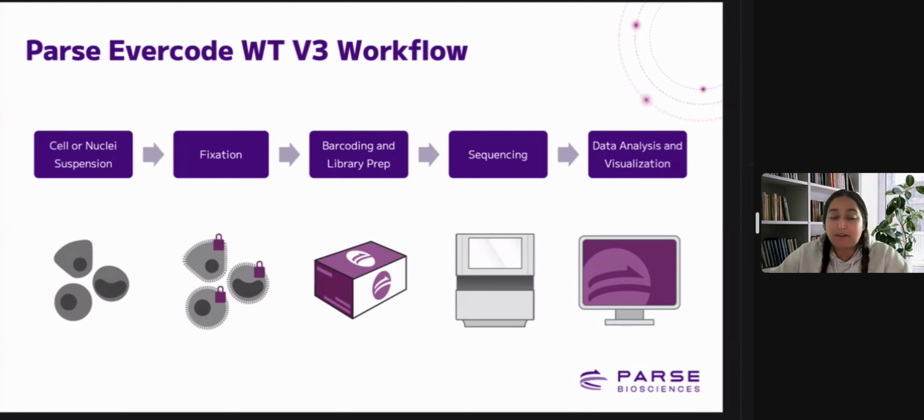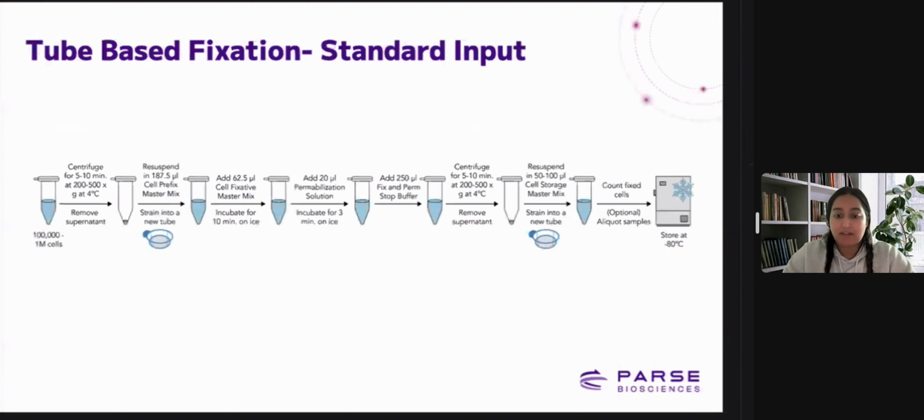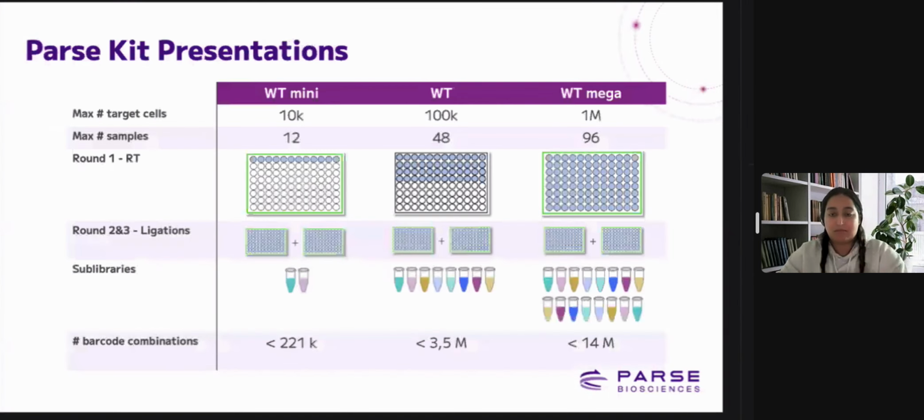After we're done with our libraries, we'll send them for sequencing. When you guys get your FASTQ back, we'll meet again virtually, and I'll show you our different platforms available. I'll actually show you a little bit today at the end, the different resources you have available to you. But essentially, what is the mini kit? So I'll just skip that, just to go over the kit in general.